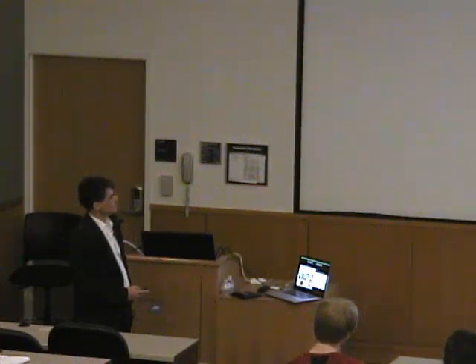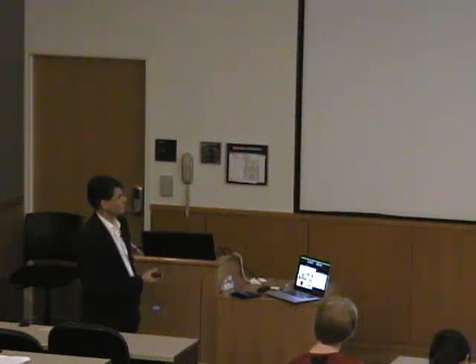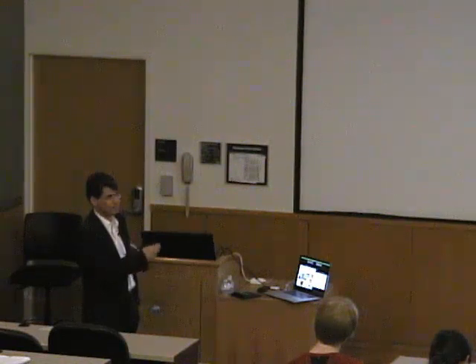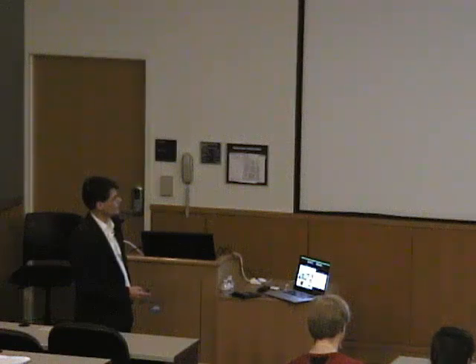The sample actually sits in a cell like this, a copper cell. It needs to be made out of a conducting material, a heat-conducting material, so that the temperature at the sample is really the temperature that you also have inside your cryomagnet. It sits on top of a rod that is pulled down into the sample compartment here, and this is how it looks.